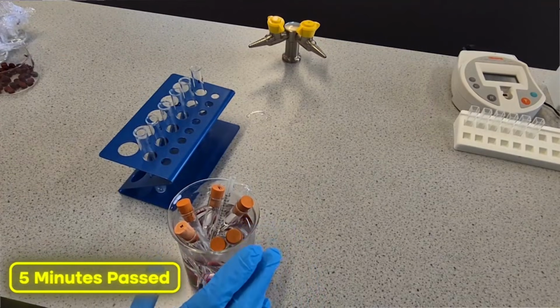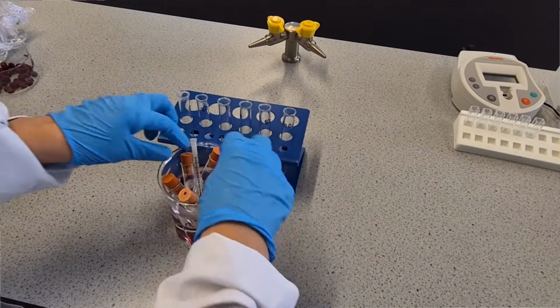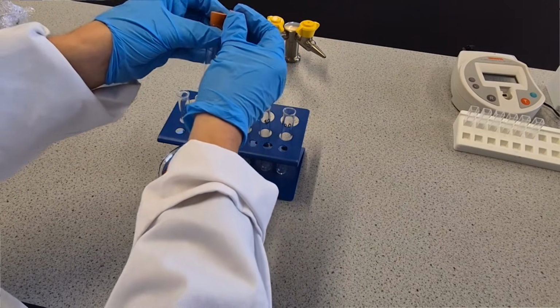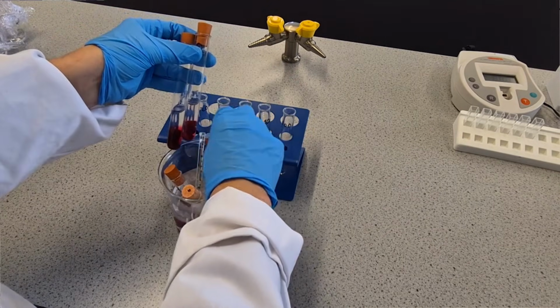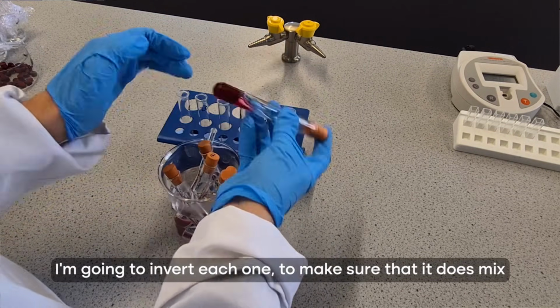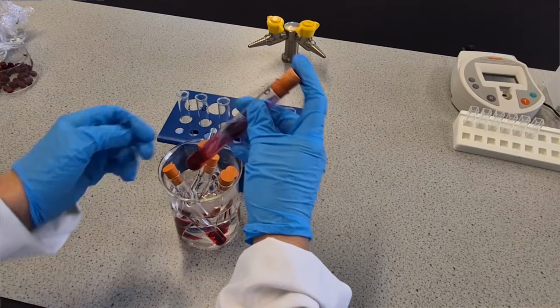So I've left this now for 5 minutes. I now need to put my samples into the cuvette. Just to hold them up to have a little look, we can see, so this one here is 0%, we've got 10%, we can see there are visible differences here. What I'm going to do is just invert each one to make sure that it does mix, so we've got all that pigment into the solvent.